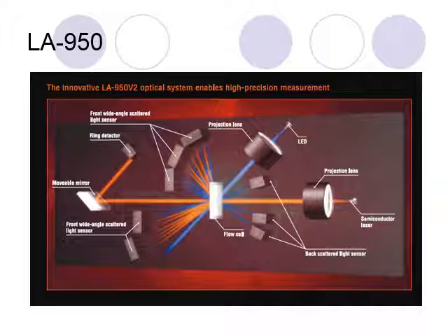What's interesting about this system, what they realized, is that adding a second light source with a different wavelength actually allows them to get better scattering information and more measurement over a different range. So they've added a second. Instead of just that red semiconductor wavelength, they have a blue LED light that they also use in a different position. So you can really get nice measurements out of this system by using this dual setup.